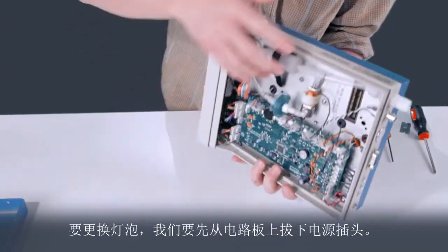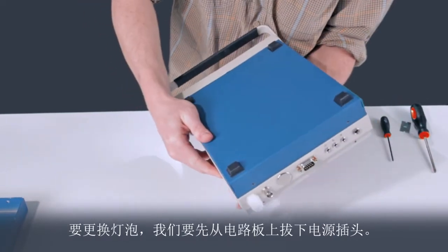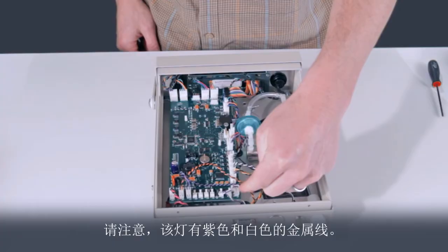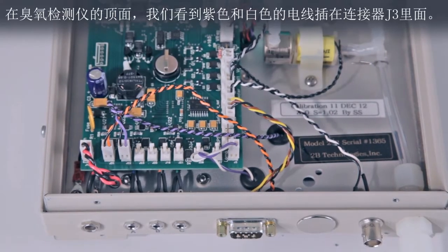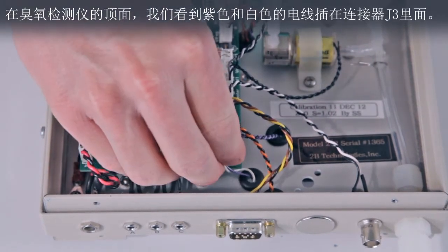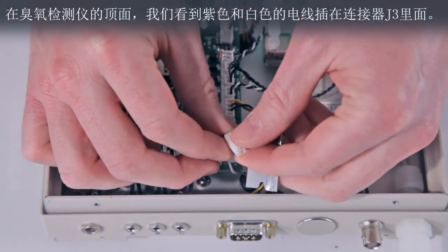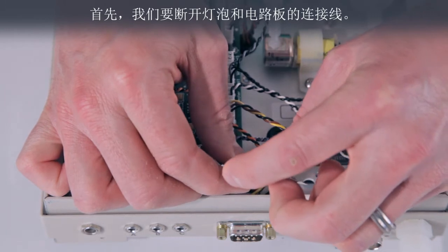To change the lamp, we will first unplug it from the circuit board. Note that the lamp has purple and white wires. On the top side of the ozone monitor, we see the purple and white wires plugged into connector J3. To begin, we will unplug the lamp from the circuit board.